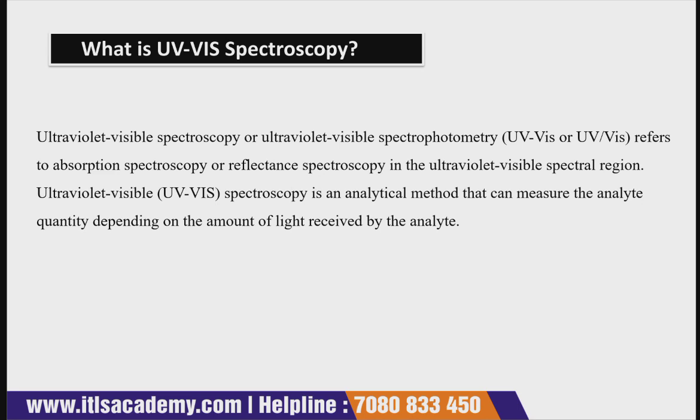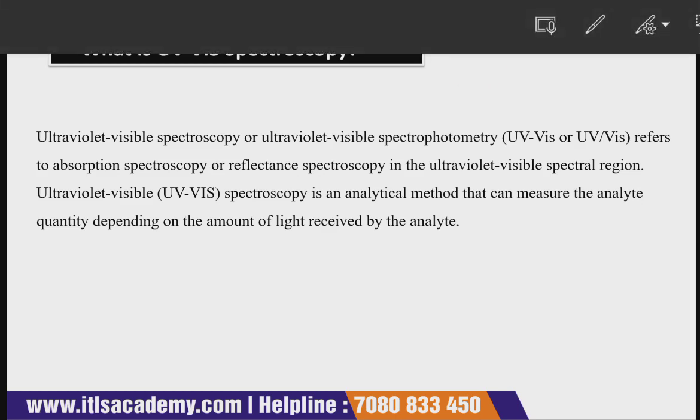So what does this spectroscopy mean? This type of analytical technique is equipped with the visible as well as the ultraviolet ranges of the spectrum.